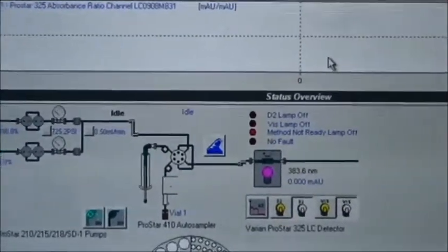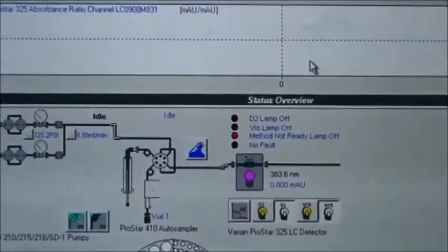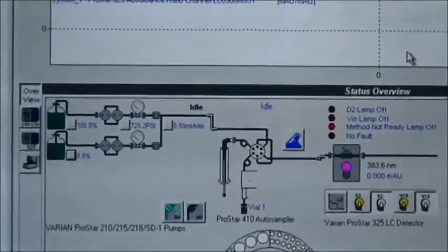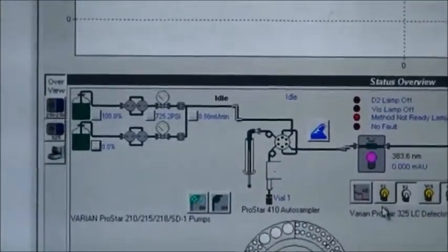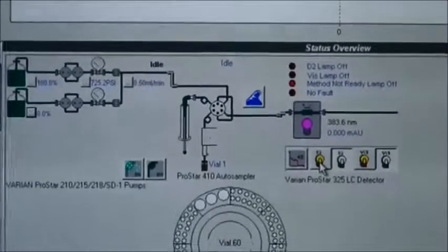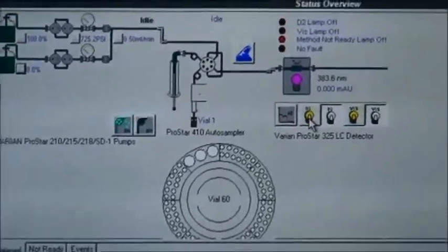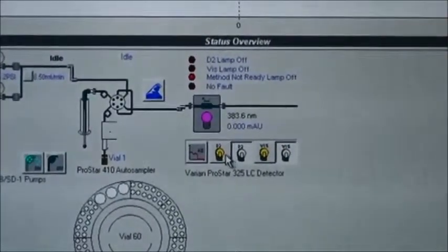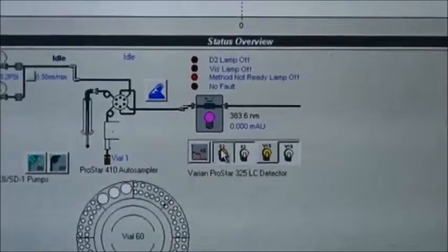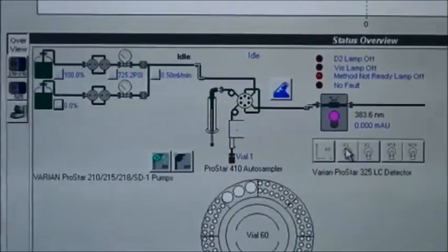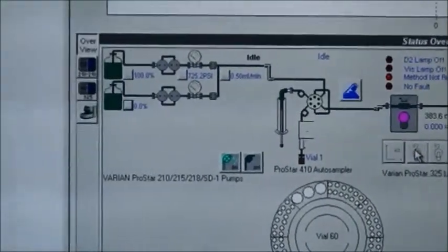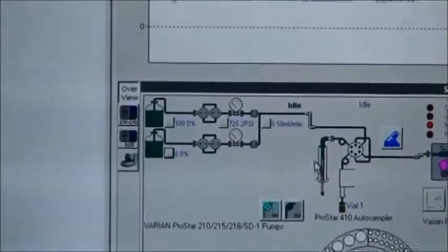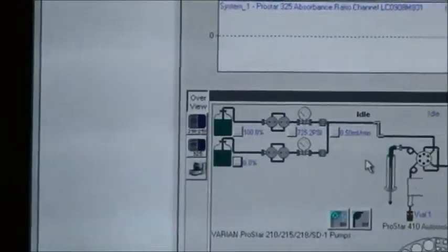Before you start injecting your samples, after we turn the pump on, the next thing we do is turn the detector on. Once the detector is on, we are ready to run.